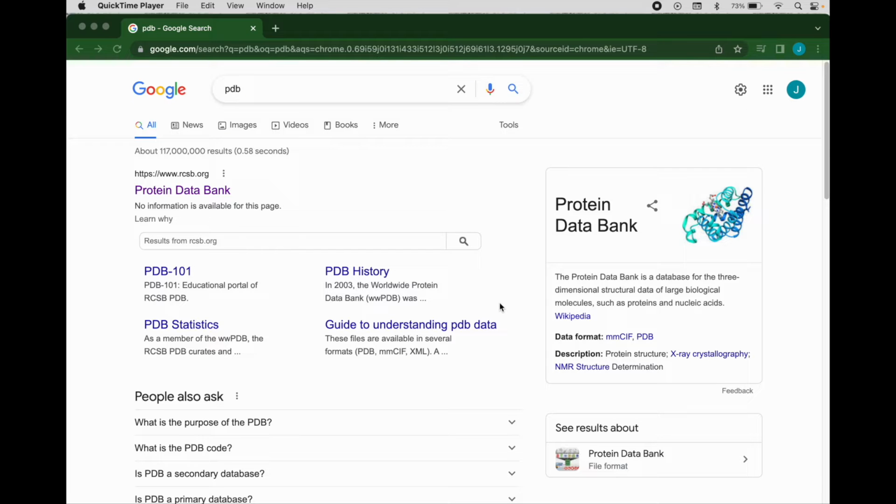Okay. So the topic of today is restriction digests, and you're in the process of doing the Digest It kit by Amino Labs. Today we're going to do a little bit of a dive into what a restriction enzyme is. We're going to look at it through molecular modeling software, and hopefully that'll give you a closer view so you can imagine in your mind what's going on in this process as you go through the real life bench or lab experiment.